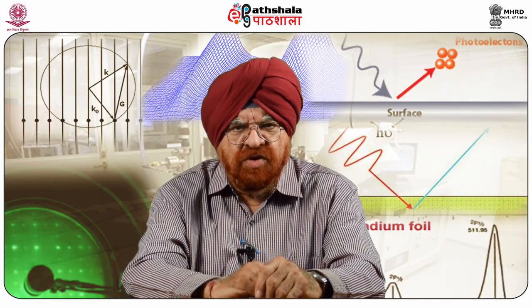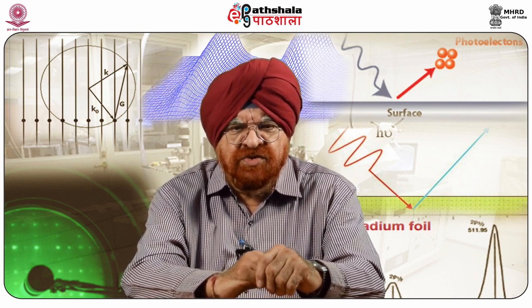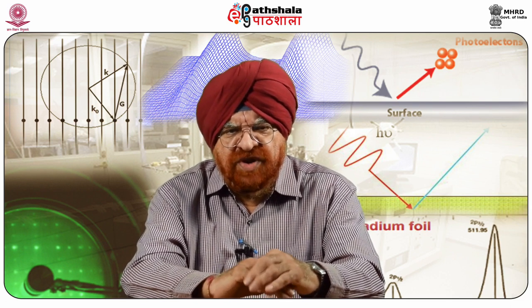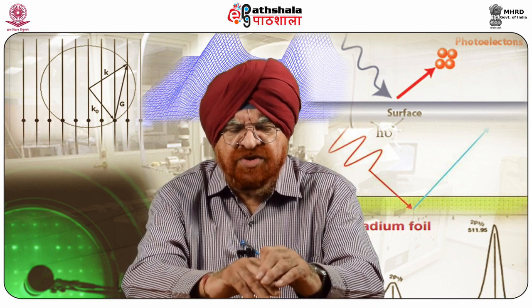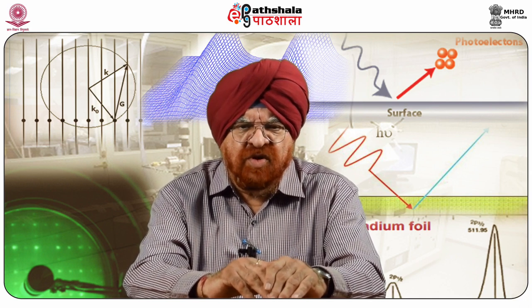Well, when we talk about the introduction, X-ray photoelectron spectroscopy, XPS, also known as Electron Spectroscopy for Chemical Analysis, ESCA, is the most widely used surface analytical technique. XPS and ESCA are both one and the same thing. It is used very widely because it can be applied to a broad range of materials and provides valuable quantitative and chemical state information from the surface of the material being studied. The average depth of analysis for an XPS measurement is approximately 5 nanometers.